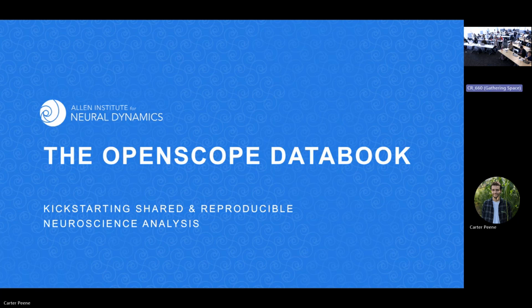Okay, thanks, Ahad. Okay, so my name's Carter. I work on the team with Jérôme. I'm an analyst for OpenScope. And my main project for the last 3 years I've been here has been the OpenScope Databook.